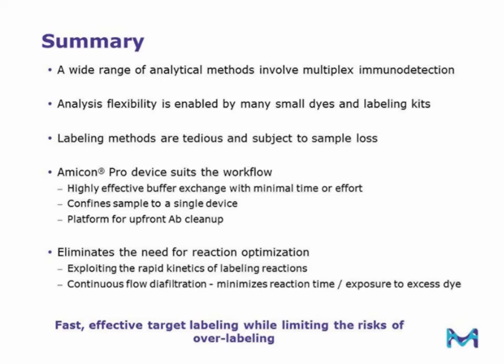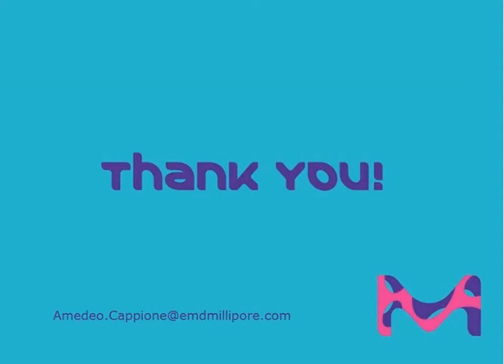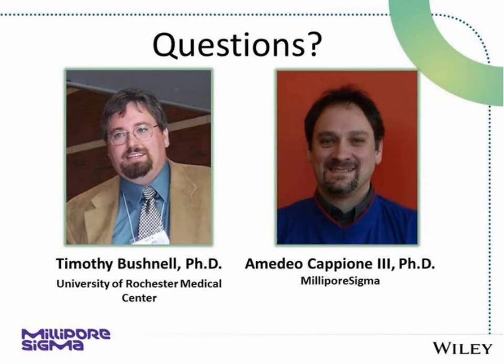Most significantly, by exploiting the rapid kinetics of labeling reactions, the process of continuous diafiltration minimizes reaction time and long exposure to excess dye, guaranteeing maximal target labeling while limiting the risks associated with over-labeling. Overall, the device offered a simplified workflow with reduced processing time and hands-on requirements without sacrificing labeling efficiency, final yield, or conjugate performance. With that, I'd like to thank you all for your attention, and we will take questions.